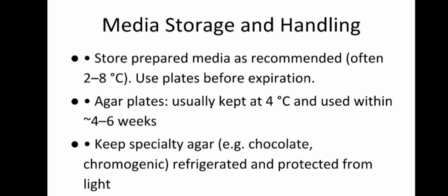Okay, and the important thing is moisture. Before the experiment, or for example during preparation, we never pour the agar too hot, or else moisture will occur. And the trick we mostly use is to just heat up the agar bed, so whatever excess moisture is present will be absorbed.